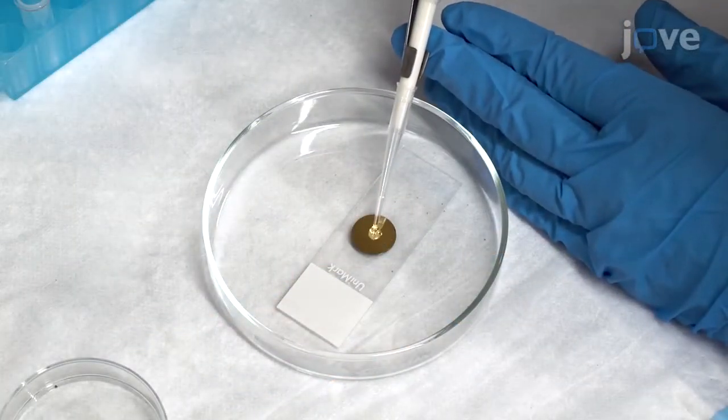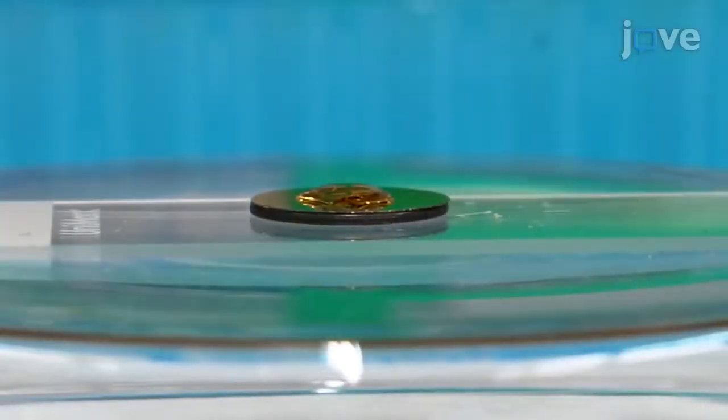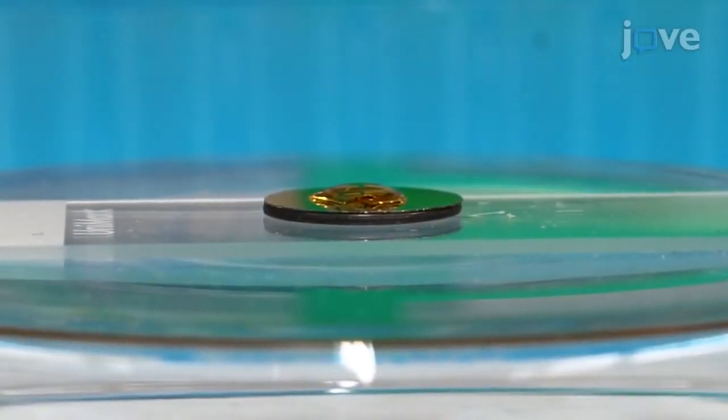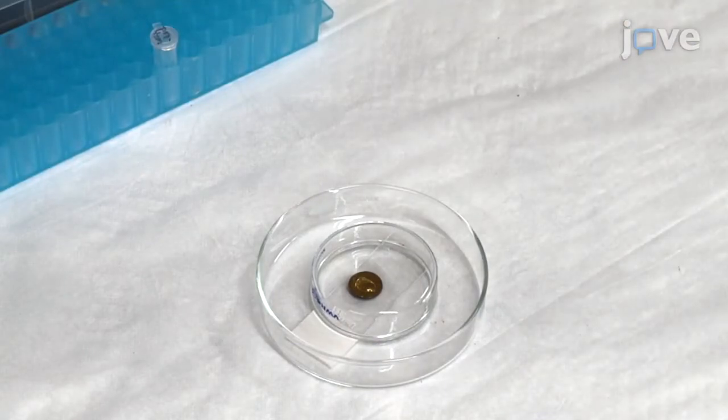Apply a 60 µL drop of the protein solution to the center of the slide. Take care not to let the liquid slip between the slide and the iron disc, as this will lead to uncontrolled sample movements during the experiment. Let the sample sit at room temperature for at least 10 minutes.